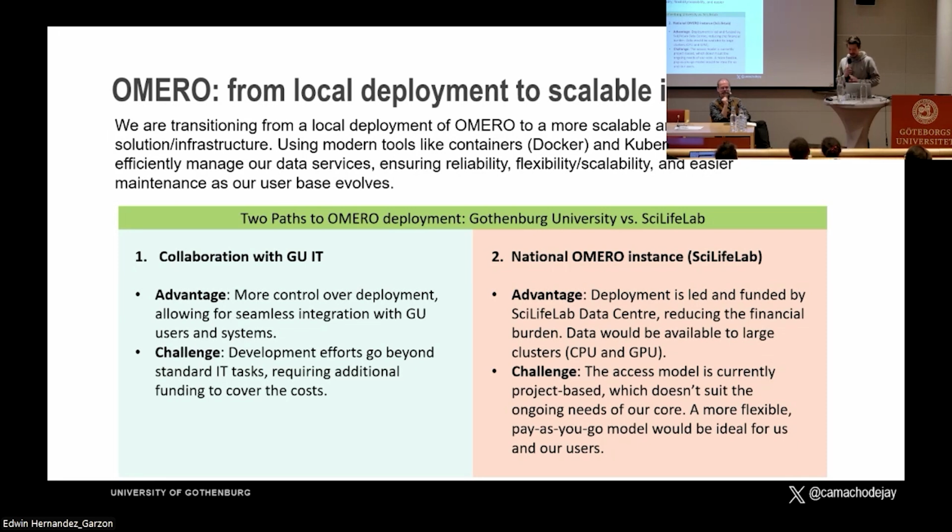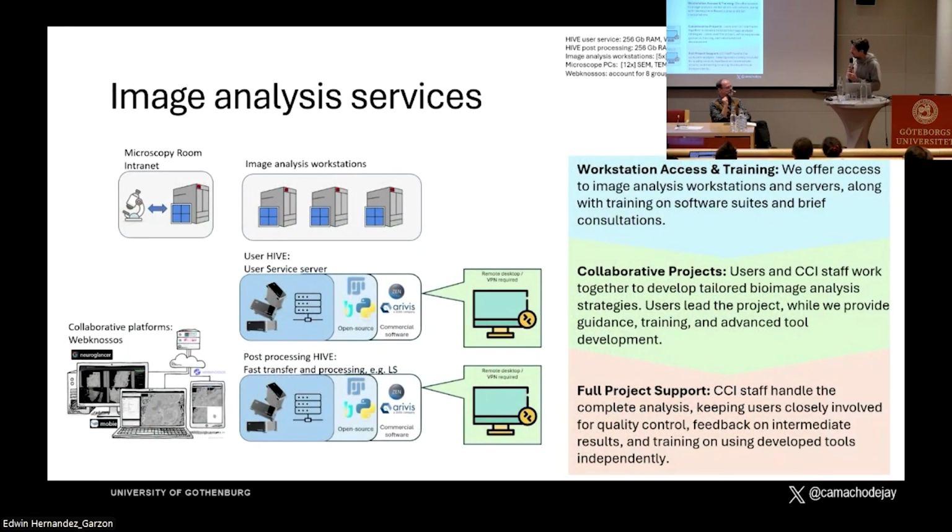So the thing is like this. A few words perhaps that are important. For the machines that are sitting in the microscope, many of them are still within service contracts. If something breaks in the machine, of course, that will not be part, but we still have some sort of support from the companies. But we have to keep up software updates and so on. And for all the rest, we are managing ourselves. So it is an effort.